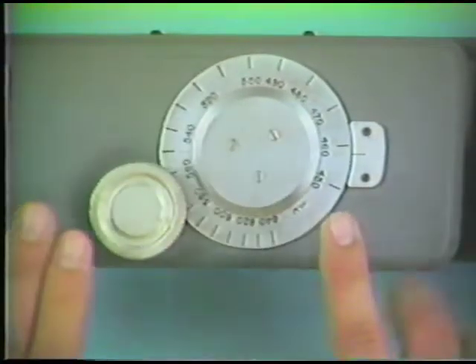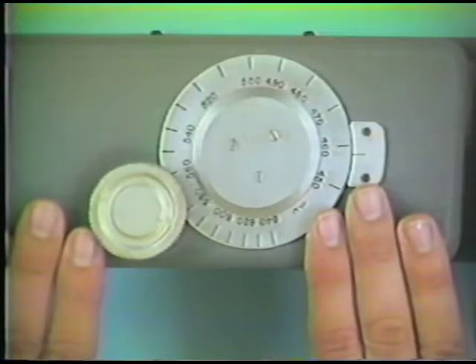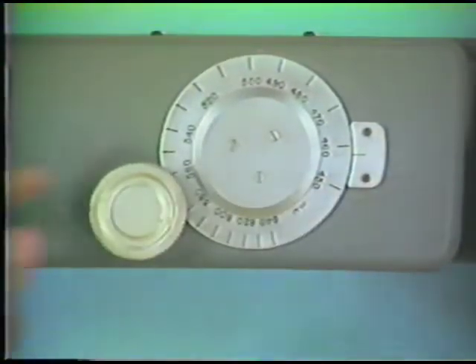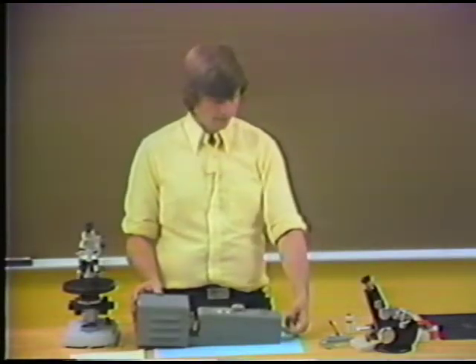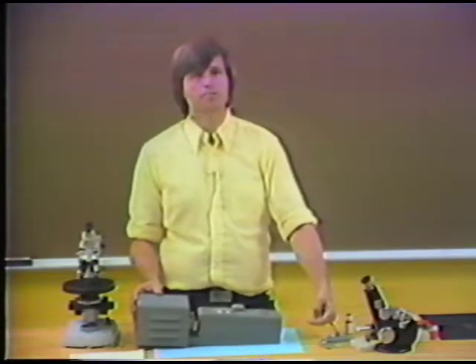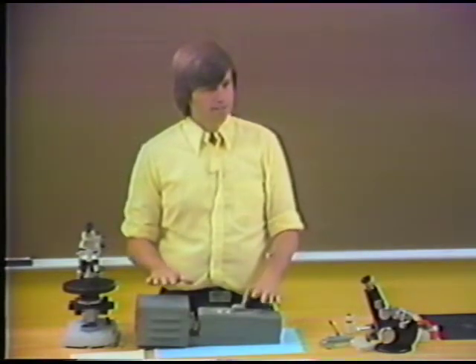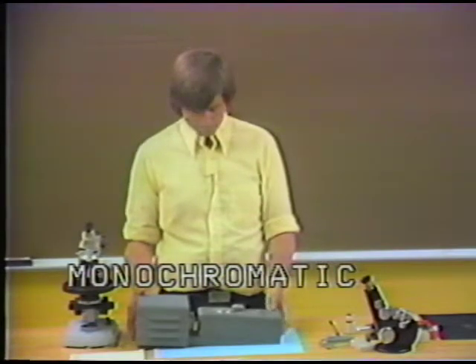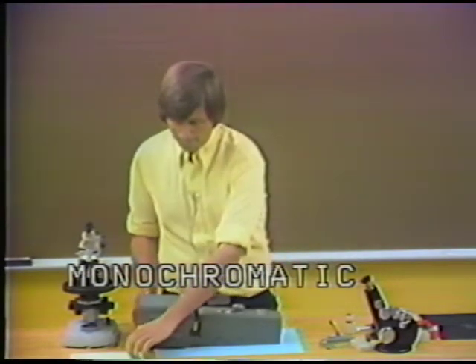And so having this grating control is important because I can take the white light and split it up into its various wavelengths. Then the light emerges out the other side of the monochromator and goes toward the microscope where it's directed by a series of mirrors. So a monochromator has a very special kind of application when we want to look at only one wavelength, or monochromatic light. We use the monochromator as an aid.